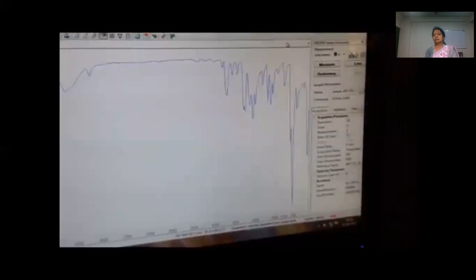In FTIR we can get spectra regardless of sample size, material and shape of the compound. So it is a very useful technique and it will take less time and is more sensitive than our earlier used KBr pellet and Nujol technique. So it is very useful.